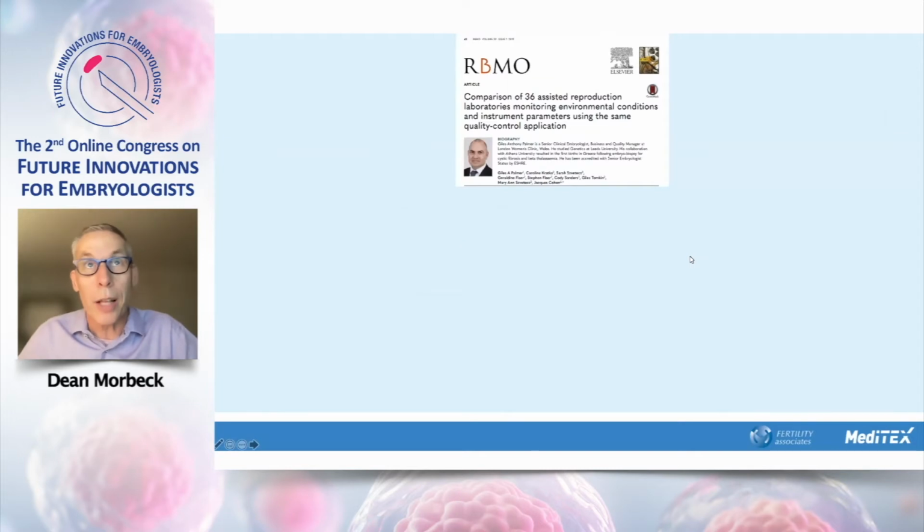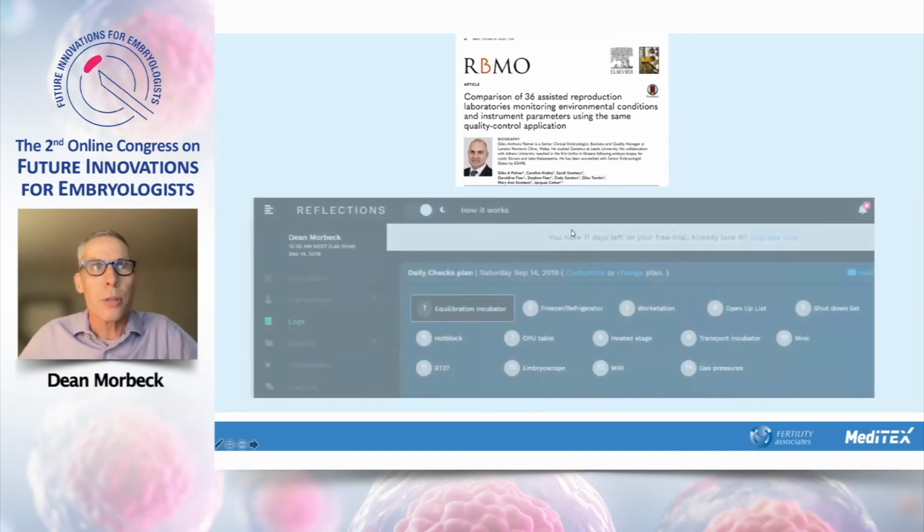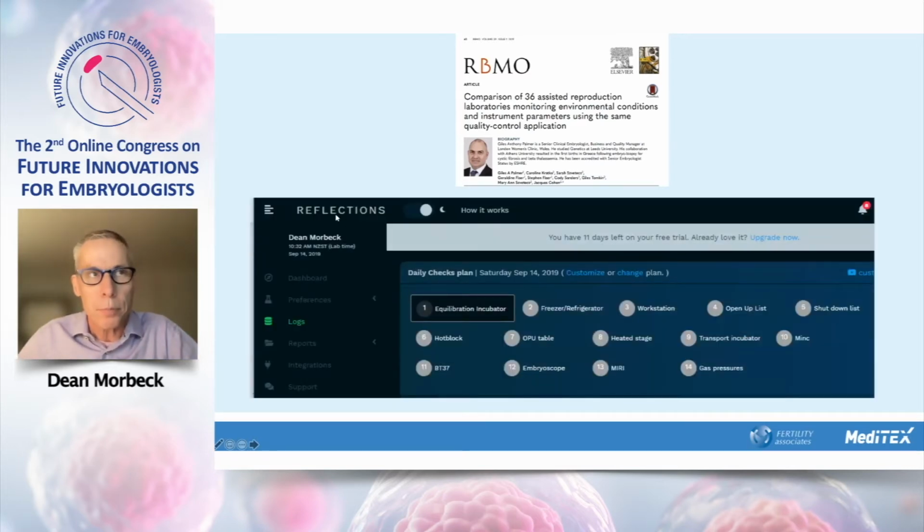Just to touch on quality control, everyone should know this gentleman, Giles Palmer, who published the article using Reflections, an app which allows you to ditch your clipboard and do electronic quality control, which is one level of innovation for QC.